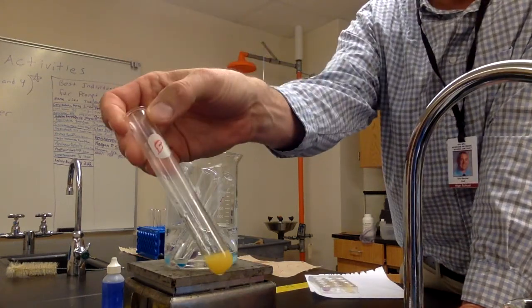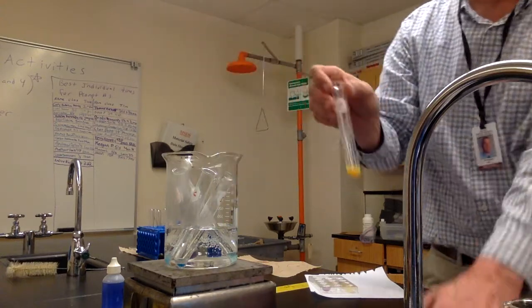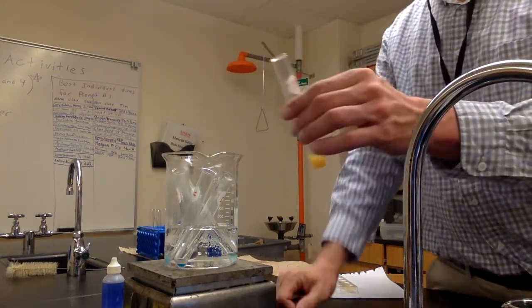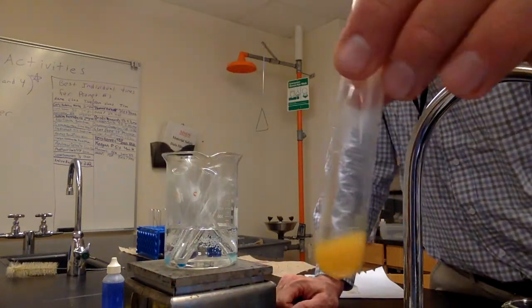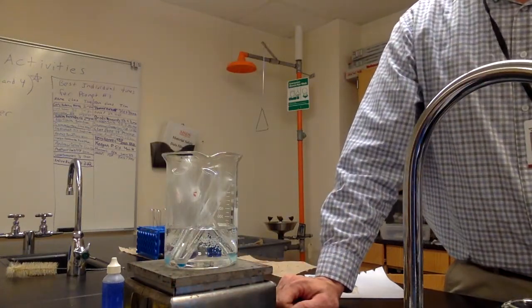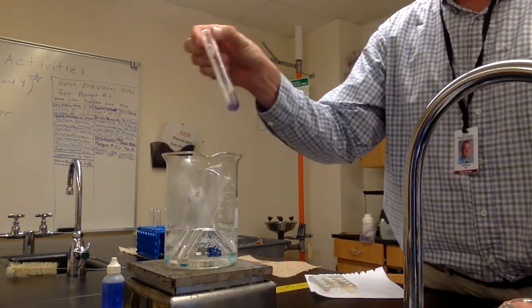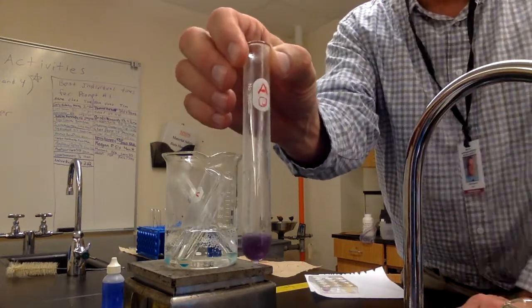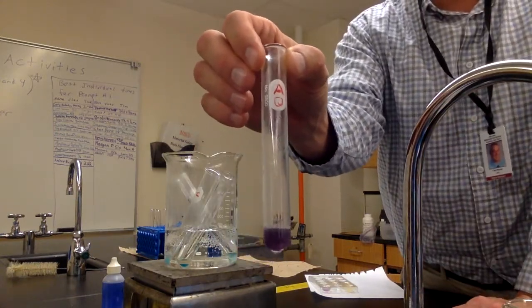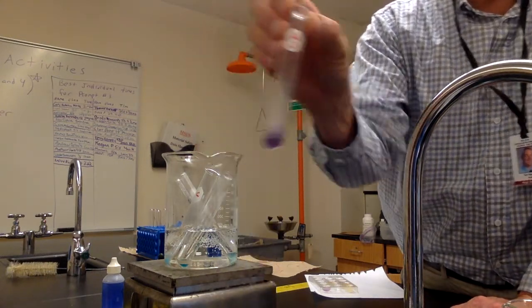So that one right there is yellow. So we know that that is positive for sugars. So B is positive for sugars because it turned yellow. Okay. This one already changed colors, but it changed colors to purple. Purple is not a positive test. So A is not positive for sugars.